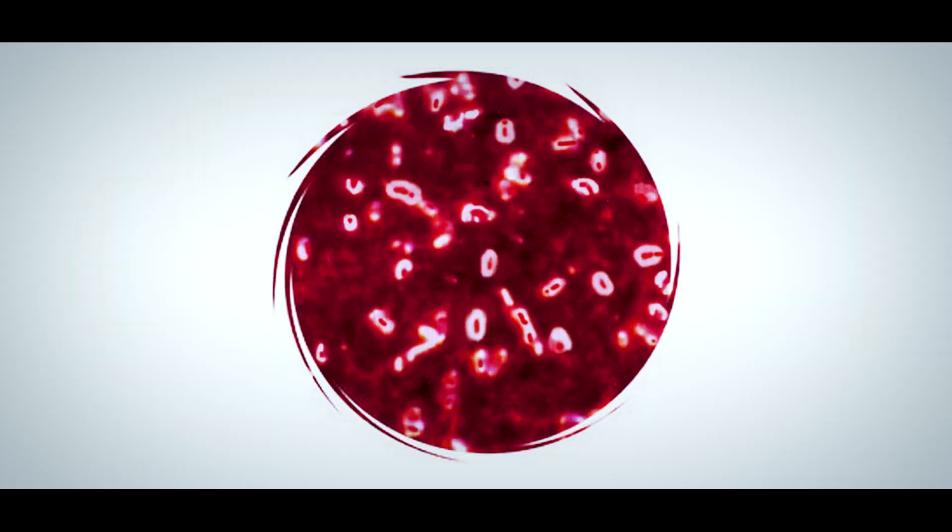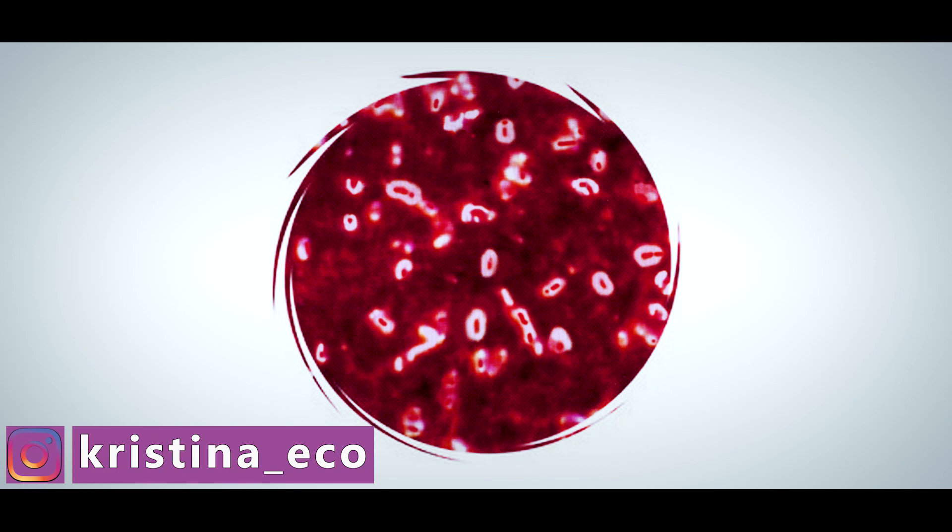This photo shows Klebsiella pneumoniae by the Burri-Gins stain.